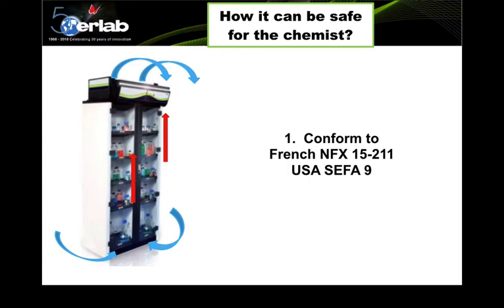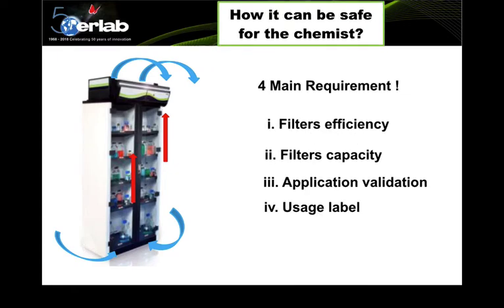This can potentially save at least 10,000 ringgit per year per unit of storage cabinet. How does a ductless storage cabinet protect a chemist? It needs to comply with international standards such as the European/French NFX 15211 and USA SAFAR 9 standards. There are four main requirements: filter efficiency, filter capacity, application validation, and use of labeling to alert the user.